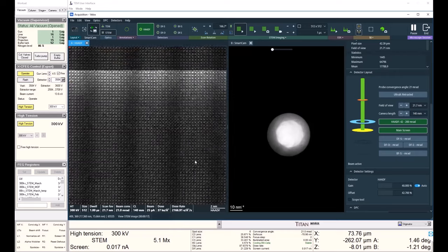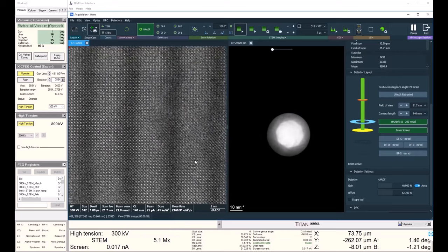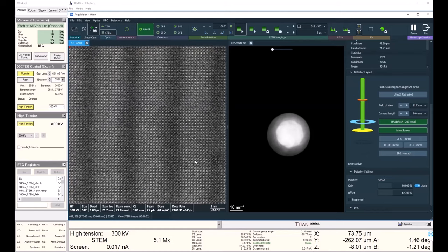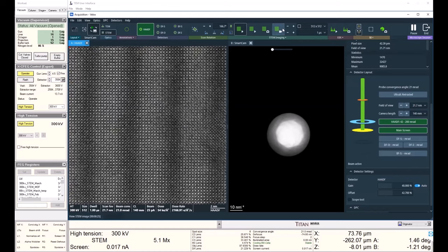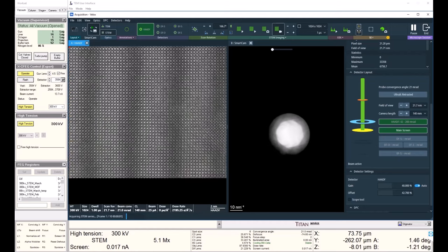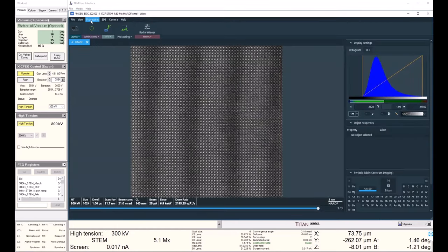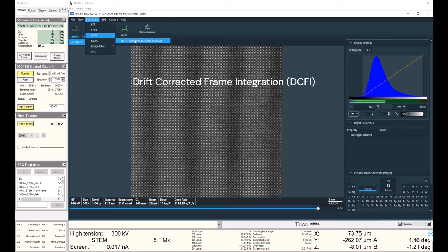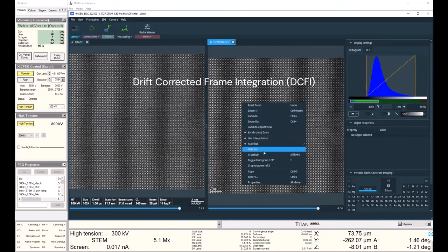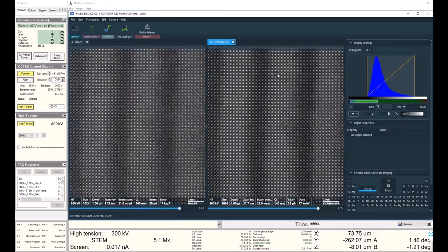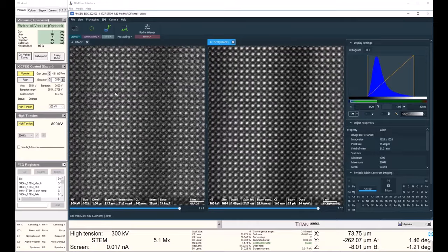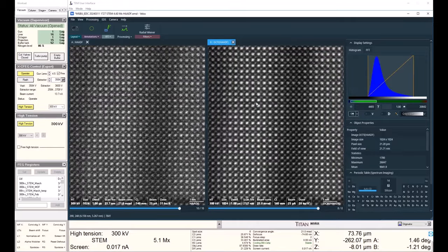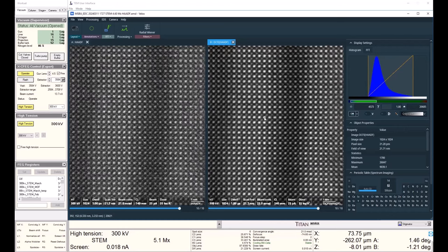I just touch up the focus and acquire my series again. I can begin my drift corrected frame integration optimized for periodic images. And this is where the DCFI is really helpful because on the left, I actually have a fairly noisy image. But on the right with the drift corrected frame integration, my signal to noise ratio is much, much better.